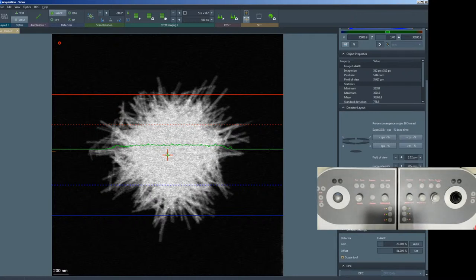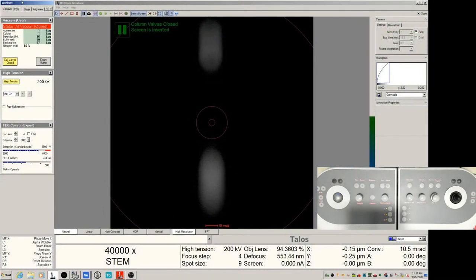Okay, if everybody has the SOP in hand, I'd like everybody to take a look at your SOP for procedure one, prepare to start. We just reviewed the software, and you also want to check a few things before you really start your session. Here you come to the TEM user interface, and in the first tab, vacuum, you want to confirm these numbers. The accelerator, that's the vacuum for the gun area, should always be one. And the column, this one, should be less than 20. If it's not, just let me know, there should be something wrong. The detection unit is usually around 16 to 20. If it's bigger than 25, just let me know.